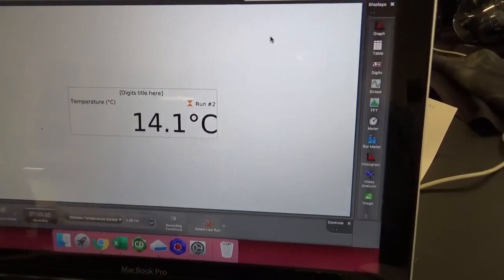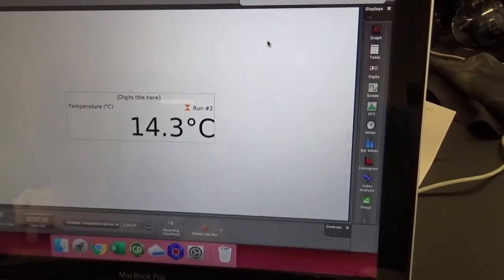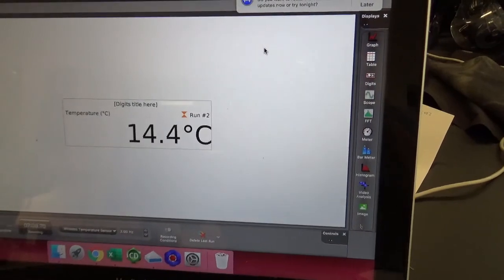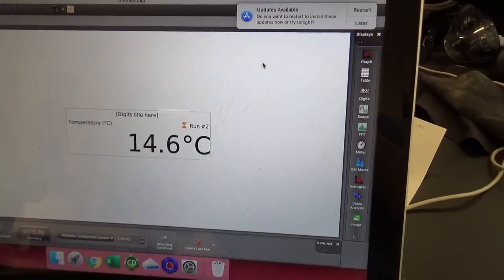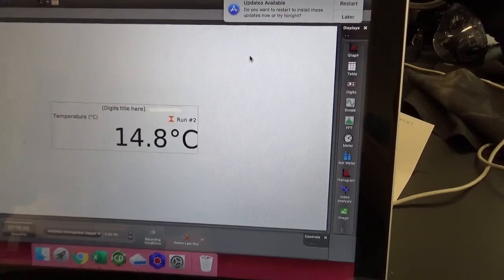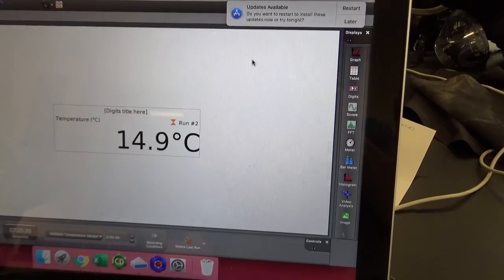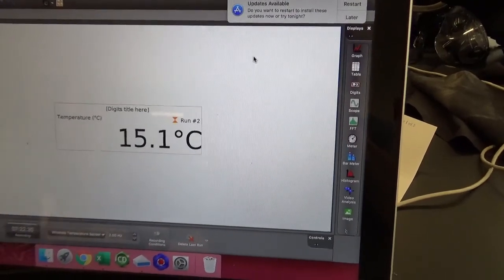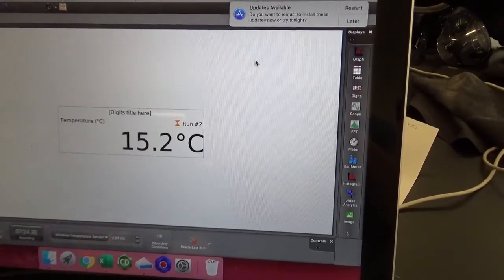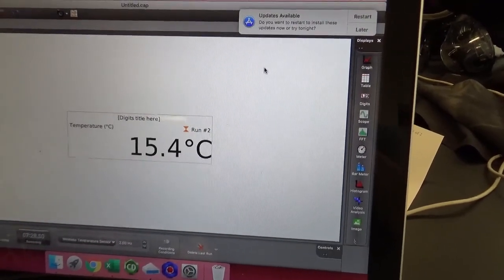And we're going to be very patient about this experiment, because if you end up with a temperature of 40 degrees C, you basically have to do it over, because you don't know what the saturated solution's concentration is at 25 if you end up at 40. So the longer you take to do this experiment, the better it comes out. I know this from experience.